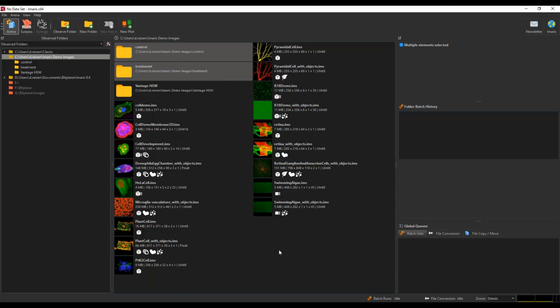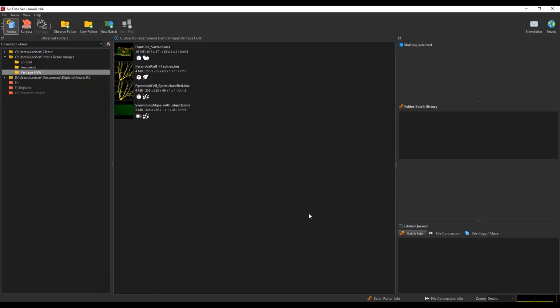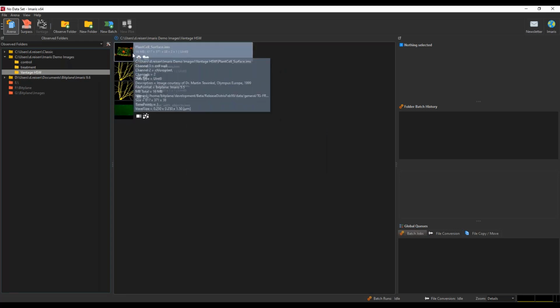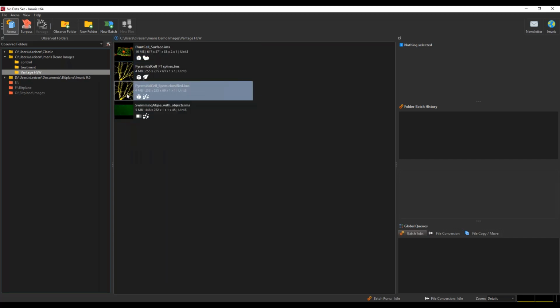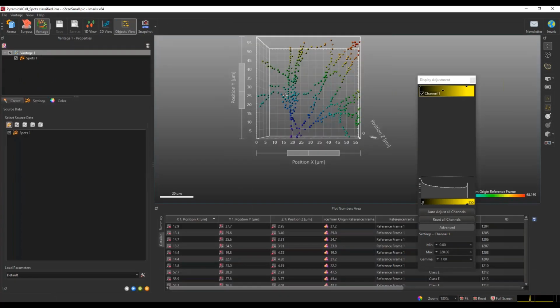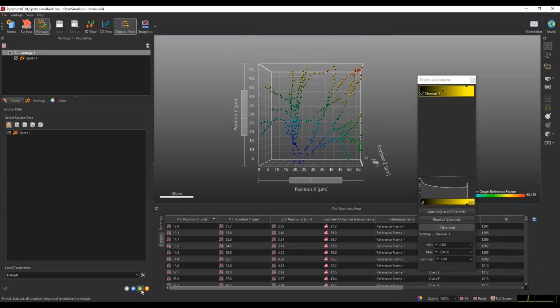Okay, so one of the other things people were asking about was just the aesthetics or the presentation of the plot, and if there are ways that you can adjust that. There are some ways, not everything is adjustable, but maybe you can go in and point people in the right direction about where they can find some of those tools.